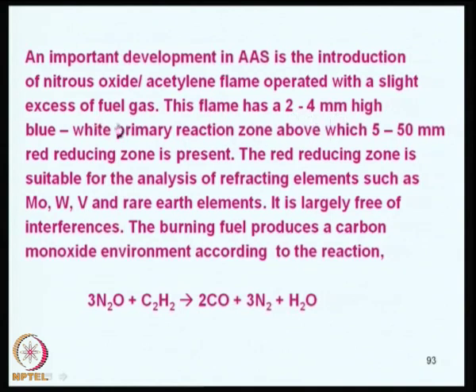It shows a blue-white primary reaction zone, above which, from 5 to 50 millimeter, it shows a red reducing zone, and the temperature in this range between 5 and 50 millimeter is always very high. So, the refractory elements can also be atomized at these temperatures.